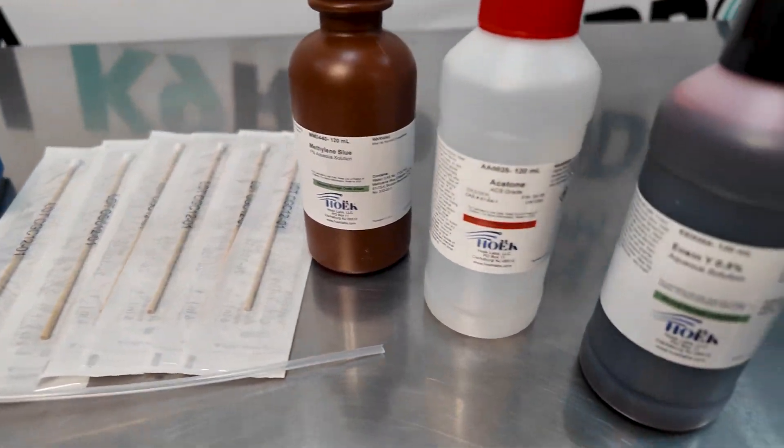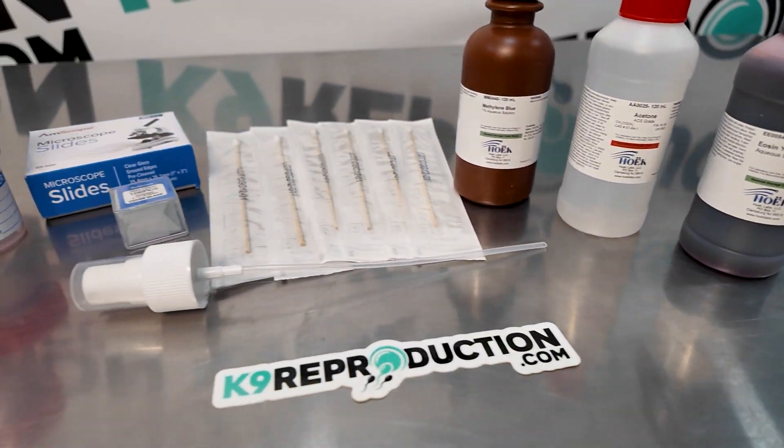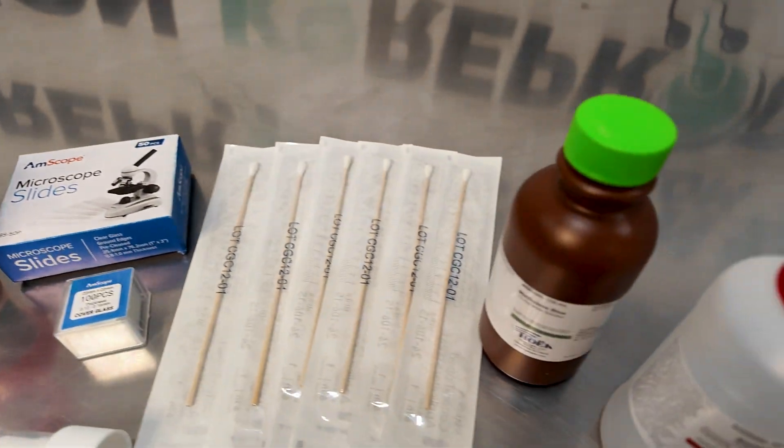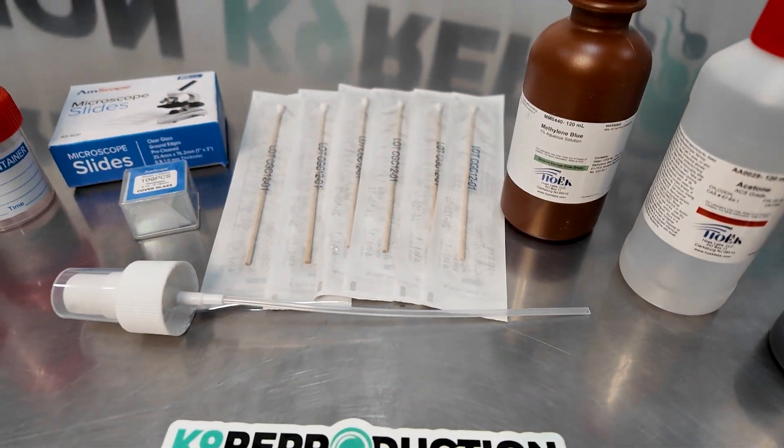This kit includes swabs, slides, staining reagents, and sterile cups. It's designed for ease of use and accurate results, making it perfect for both novice and experienced breeders.